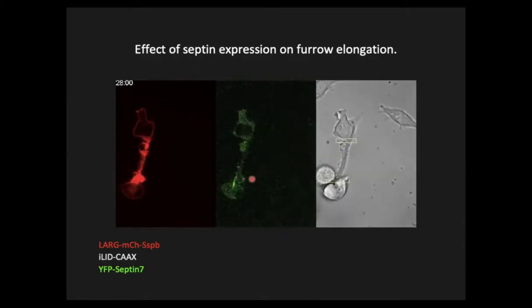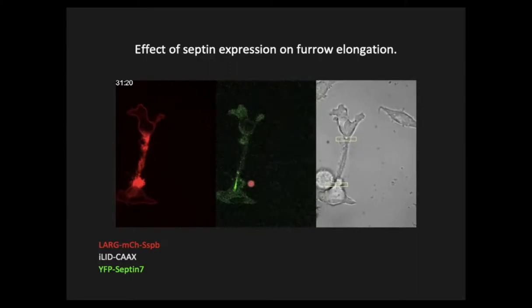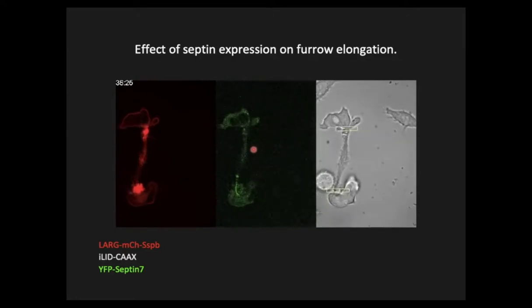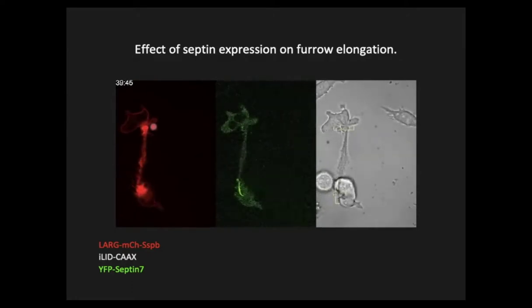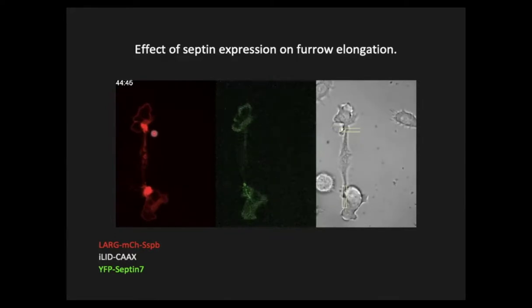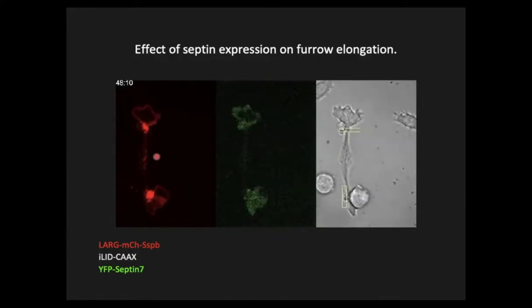You will see, also this is one of my longest videos, that when we overexpress this septin 7, we induce long bridges. We can increase the bridge length.